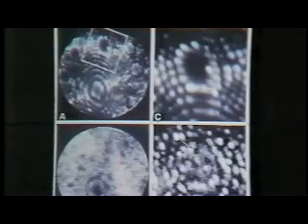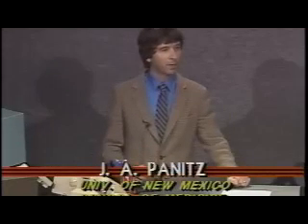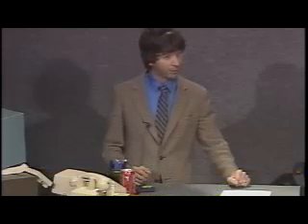Now, obviously, you can use this technique to look at surface processes, catalytic processes like hydrogen diffusion, as we looked at. Suppose you were looking at reconstruction. I showed you an example in the field ion microscope, but there are other reconstructions that people have become very interested in, reconstructions of semiconductors. Most of you have probably heard about the 7x7 reconstruction of silicon that has been seen by a new microscope called the scanning tunneling microscope. Field ion microscopy has never seen real, true reconstructions of that kind.